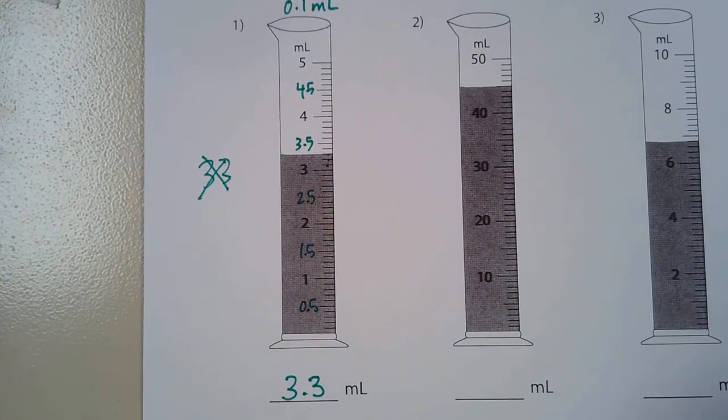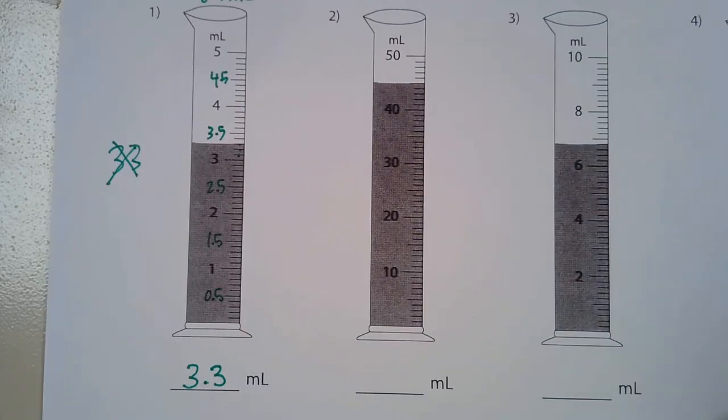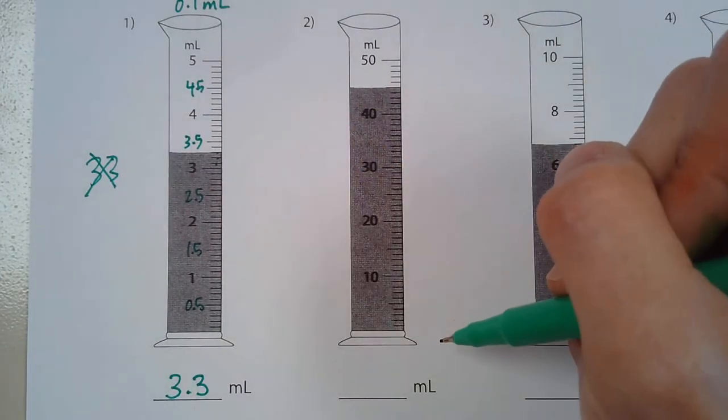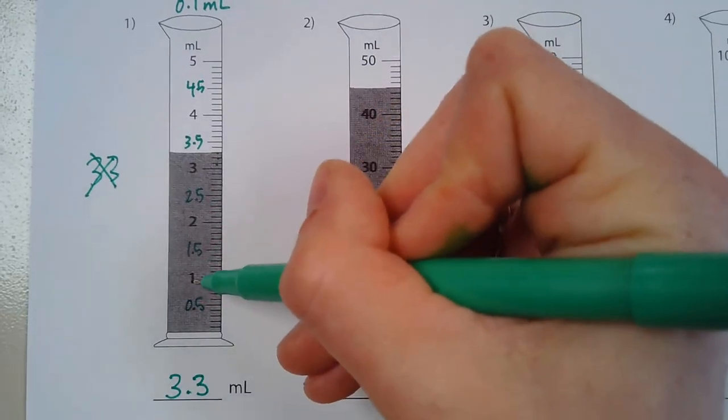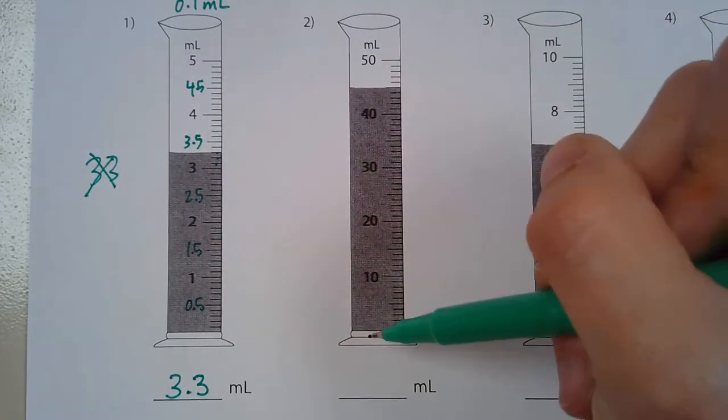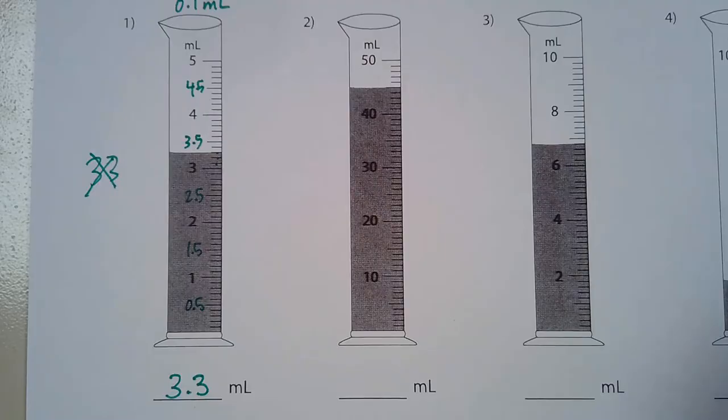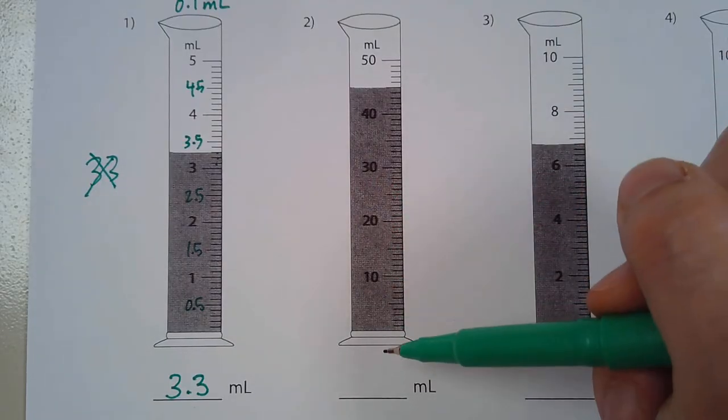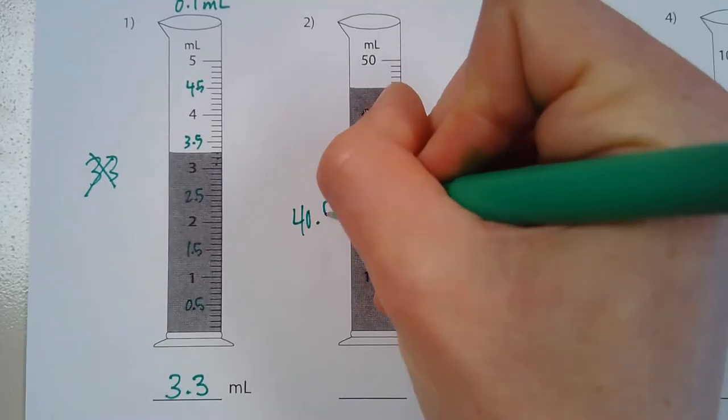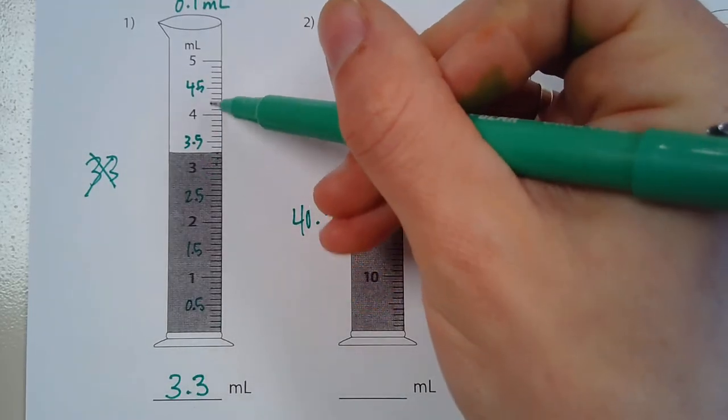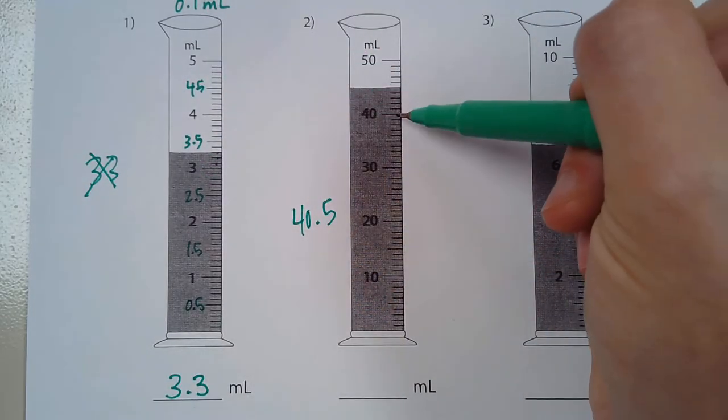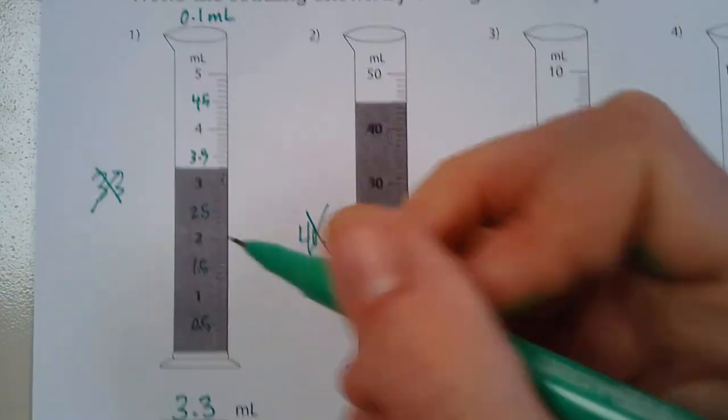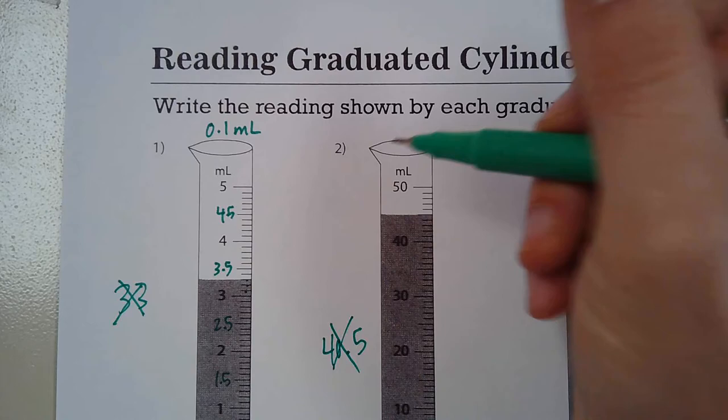This next one has a different scale. So if you notice this one over here is 1, 2, 3, 4, this one's 10, 20, 30, 40. And so I've had some students turn this in with the answer 40.5 because well like this one in between would be 0.5 and so they think well it's 40.5. But this one is not a scale of 0.1, it's a scale of 1.